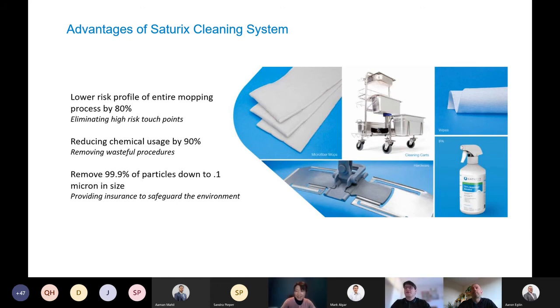So the first question we have here, Ying, is how do you decontaminate the cart, including the casters? Well, I would encourage you to follow your existing SOPs to maintain, clean, or disinfect the cart. We have a cleaning stainless steel cart, and they're 100% autoclavable for at least 50 times.